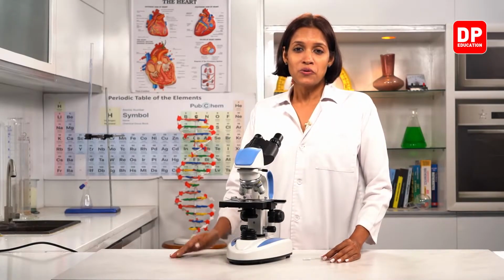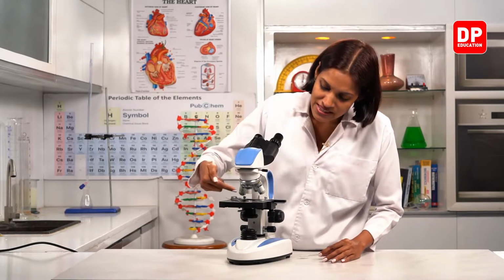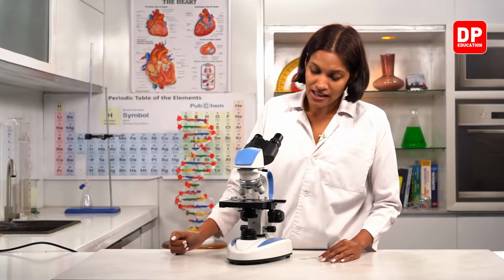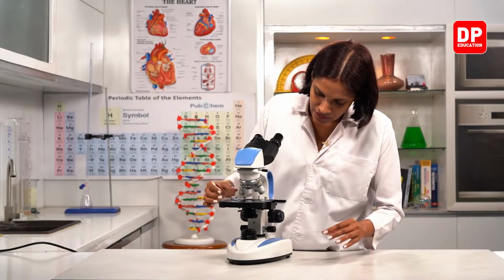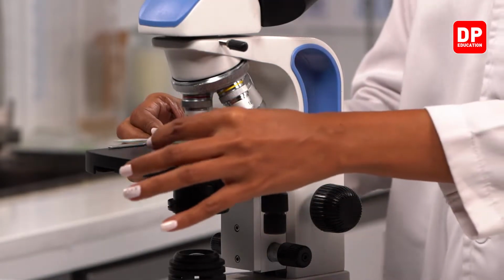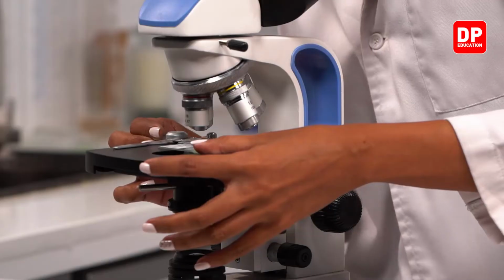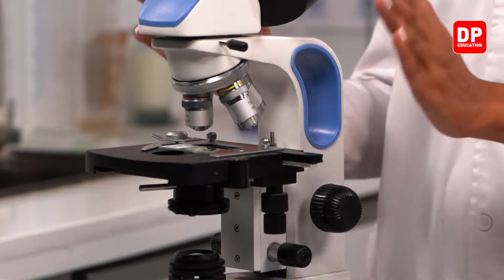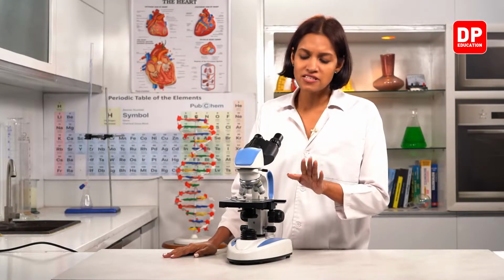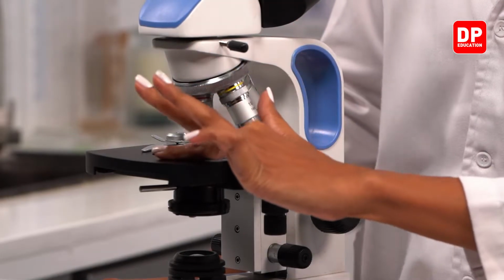Make sure whenever we are going to place this slide on the stage, always this low power should be aligned with the stage, right? Okay, children. This is how we do. And using the stage clips, you have to fix it. I already showed you all how to do that earlier. Right, children? So what is the reason we always place this low power lens in line with this stage, children?